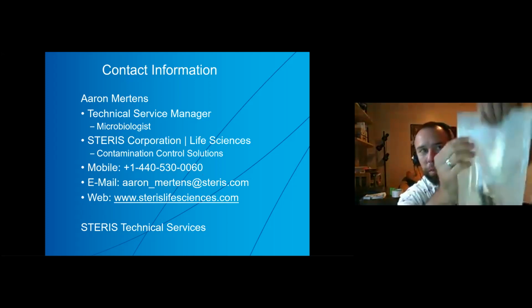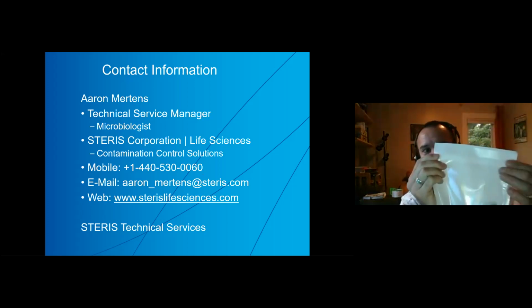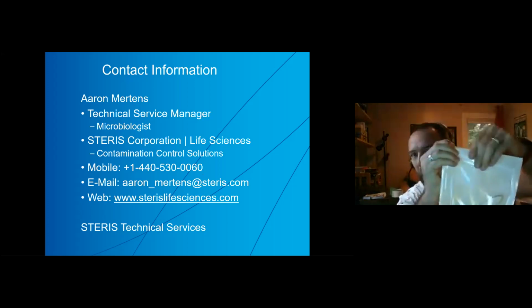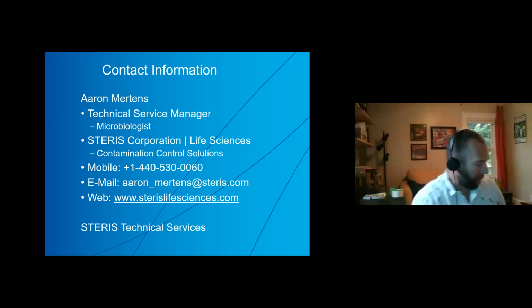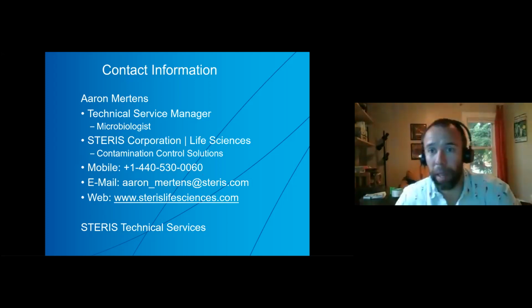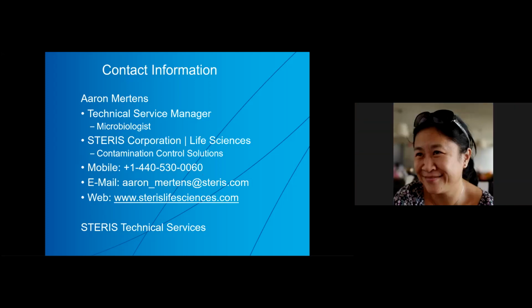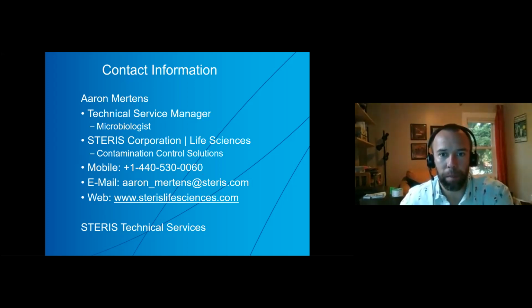So you place the equipment in here and you can expose the adhesive and fold this over, and now the bag is sealed, ready to go in the autoclave. That really is the best method for small equipment like that. Just make sure if you're using a self-seal bag like that, my recommendation is to be sure that it's made of a Tyvek material versus a paper material due to the reduced particle generation and the better microbial barrier properties.